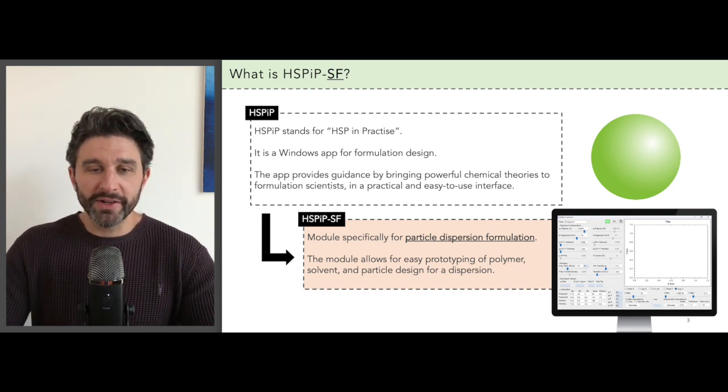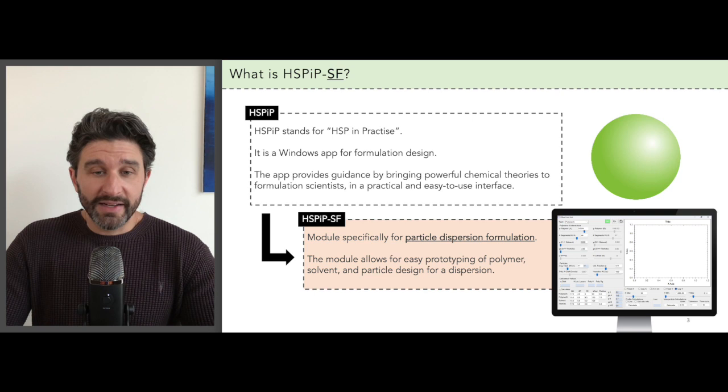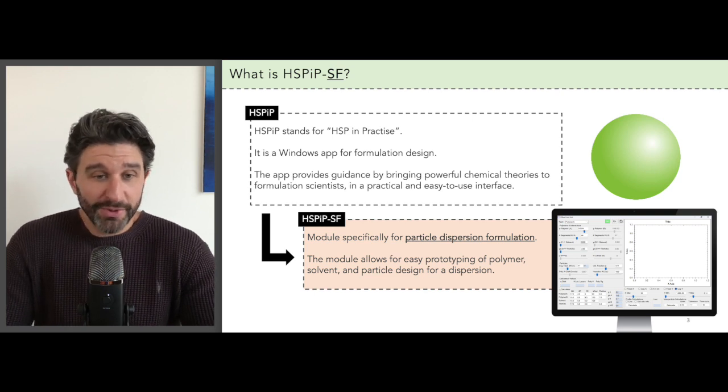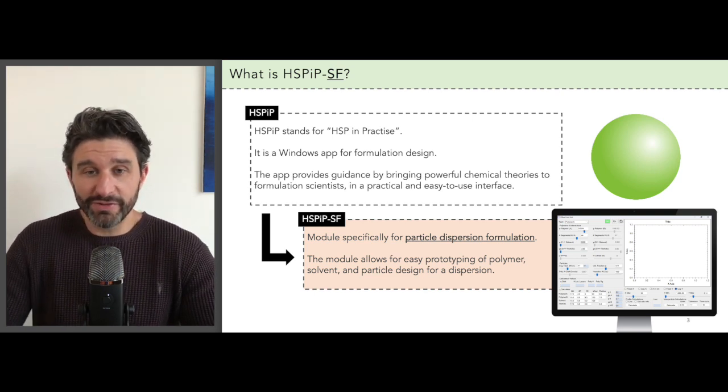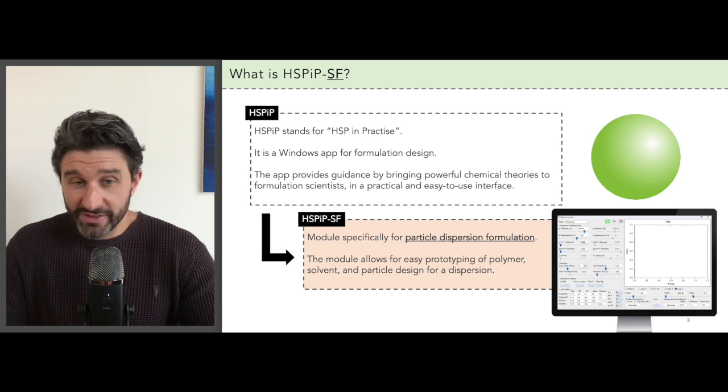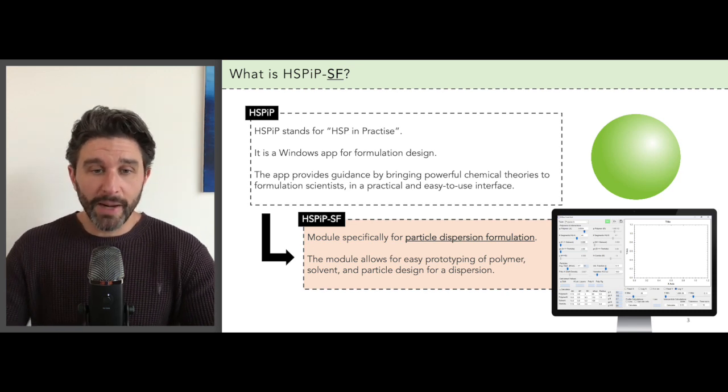The goal of this new module is to provide an easy and interactive environment where you can actually prototype your polymers, your solvent, your particles, and interactions in order to create a new or optimized dispersion.